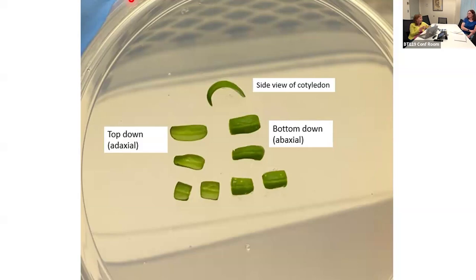Yeah, so baby food jars are great for some applications, but since we transfer a lot to it, we'd have to use a lot of baby food jars, and they're a smaller container, and our protocol is based on magenta boxes, and even just changing a culture vessel can make a difference between success and failure. I know there are some people that are using other types of disposable plastic containers, but we can't in our hearts contribute any more to the plastic waste stream. We go through enough plates and boxes and waste stream, and we've been using the same boxes for years now.